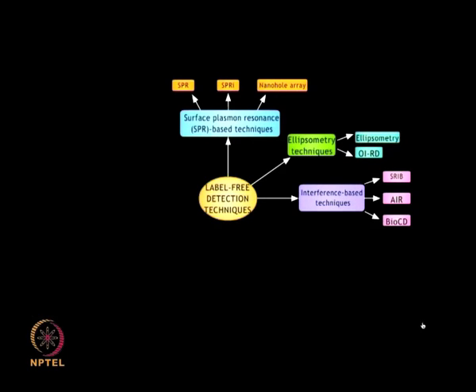First, SRIB, Spectral Reflectance Imaging Biosensor. The changes in optical index due to capture of molecules on the array surface are detected using optical wave interference. AIR, Arrayed Imaging Reflectometry, the destructive interference of polarized light reflected from silicon substrate is captured and used for detection.